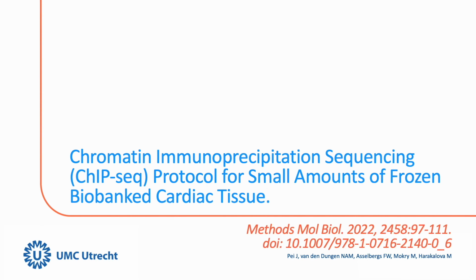Chromatin immunoprecipitation sequencing, ChIP-seq, protocol for small amounts of frozen biobanked cardiac tissue was published by Methods in Molecular Biology.